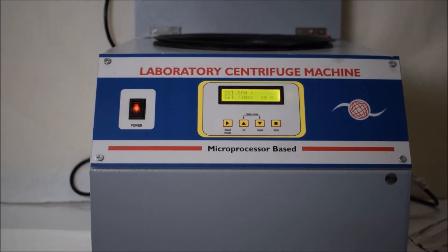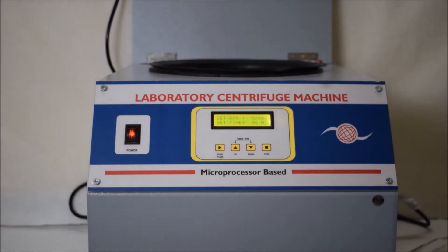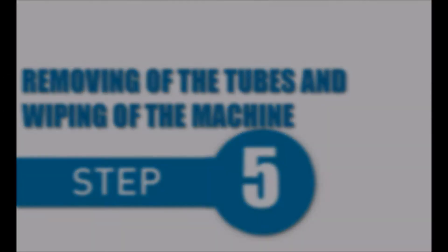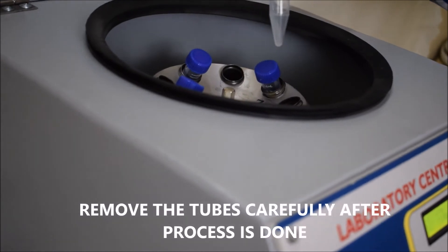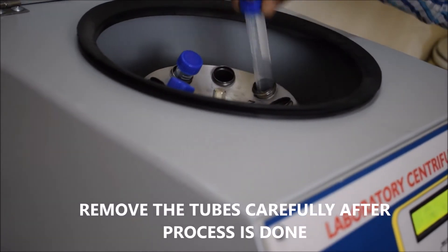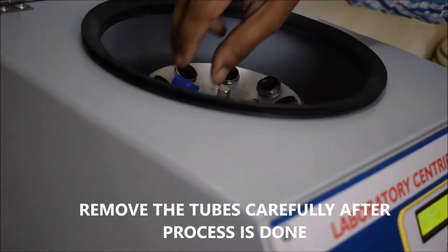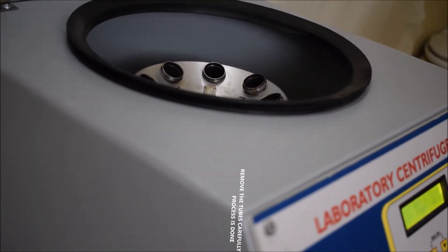Make sure you open the lid after the process is done and the spinning is properly finished. Remove the tubes carefully after the centrifuge has completely stopped spinning. You need to gently remove the tubes so that the separated suspensions do not mix again.